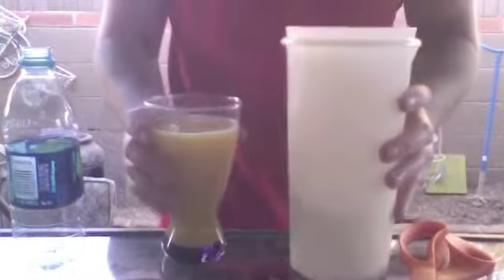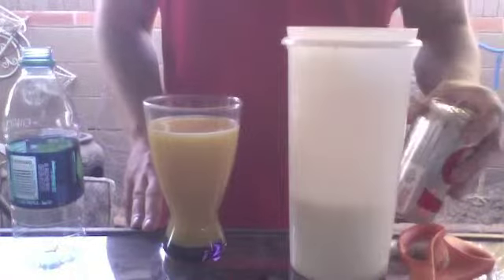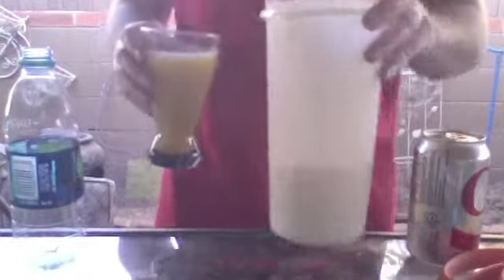Okay, now I'm going to do the test solutions. I have them outside with me. We want to make sure that they're at least room temperature. It's about 100 degrees outside, so I've been letting these just sit outside, so they're a little warm, so they should be okay.